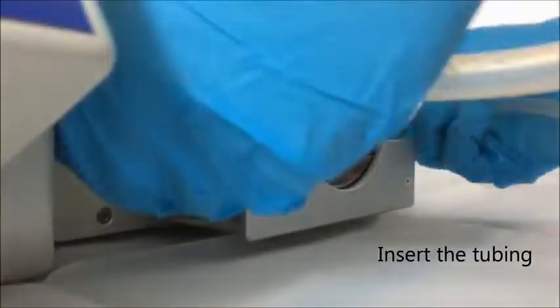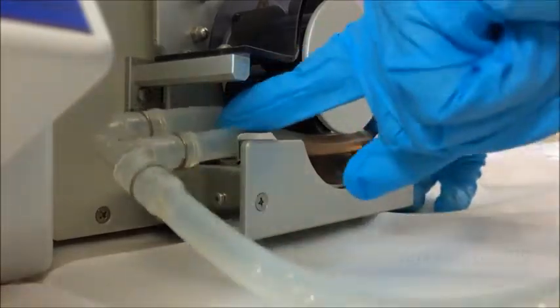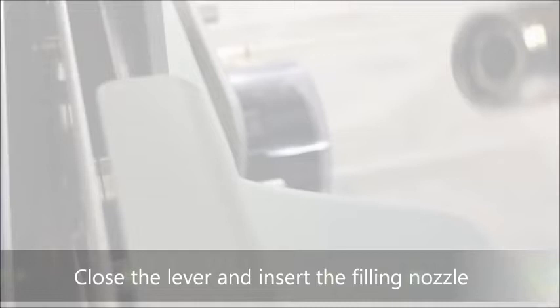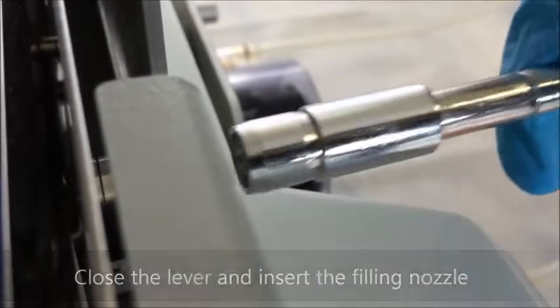Simply insert the pre-sterilized tubing set into the double-headed pump. Close the pump lever to initiate the pump. Insert the sterile filling nozzle into the chamber.